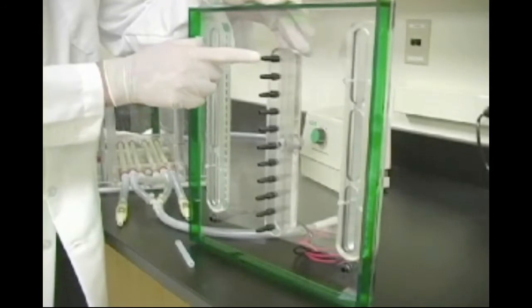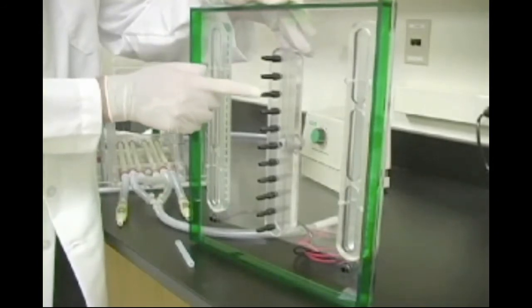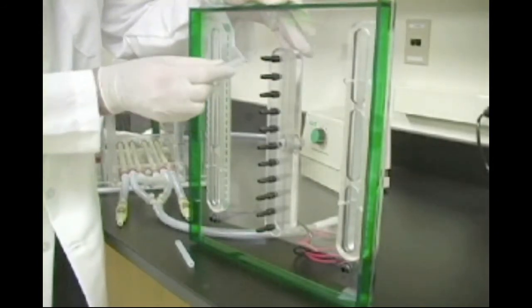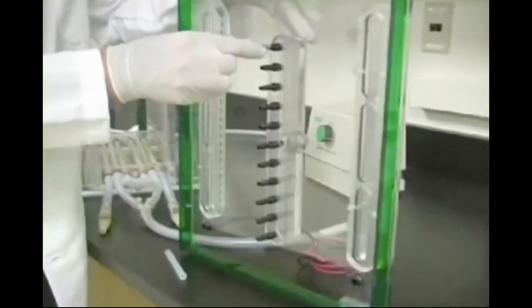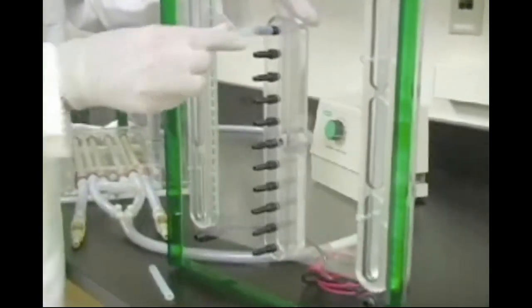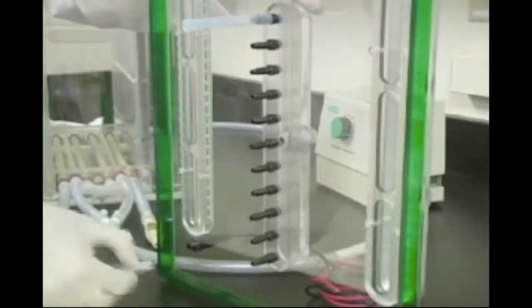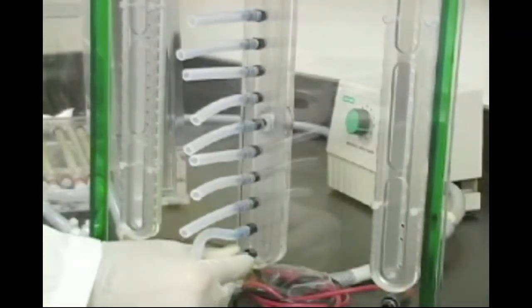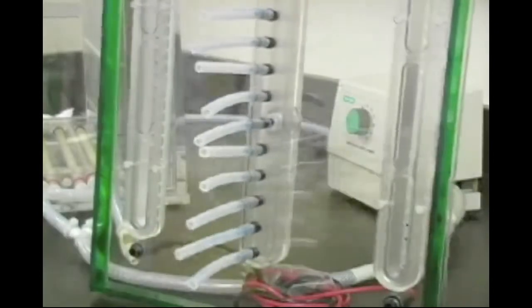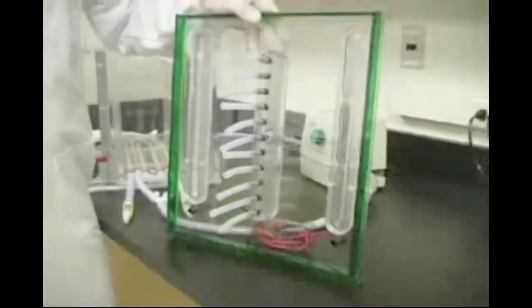When running shorter gels such as the Protean 2 Ready Gels or hand cast 20 by 20 centimeter gels, install the 11 pieces of manifold tubing onto the black fittings on the manifold in the lid. This is necessary for efficient buffer circulation and cooling. The manifold tubing should not be used if running larger gels such as the Protean Plus precast gels or hand cast gels using the Protean Plus hinged spacer plates.